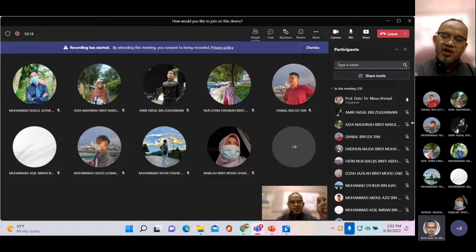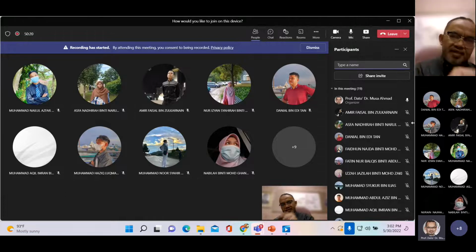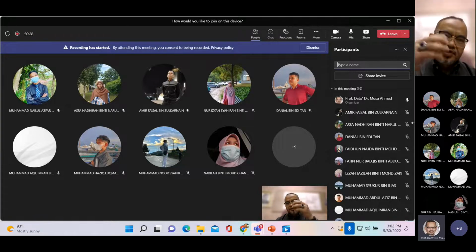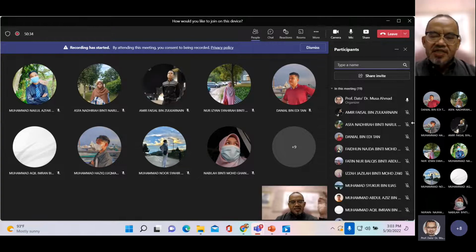So the process of doing the interpolation and getting the concentration of the unknown is called interpolation. Extrapolation is when you try to determine a concentration exceeding the maximum concentration that you prepared to establish the calibration graph. You prepare up to 500 ppm to establish the calibration graph.